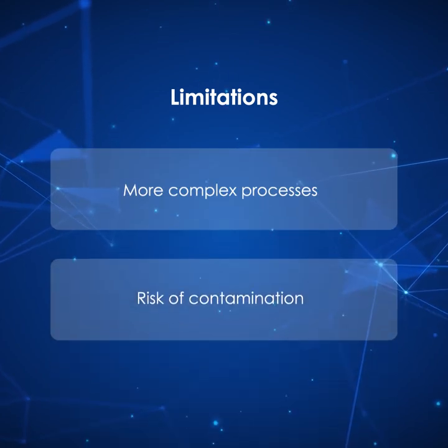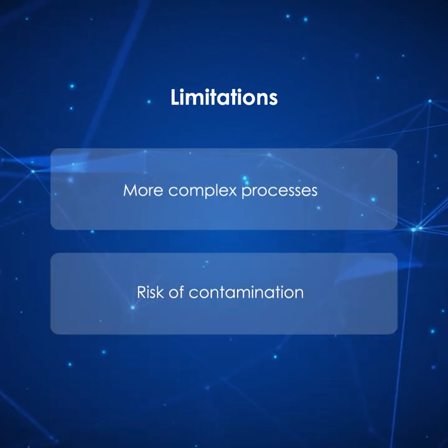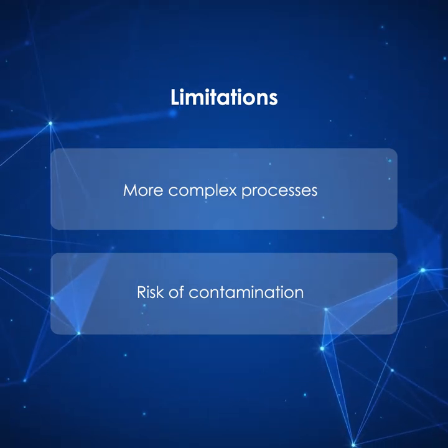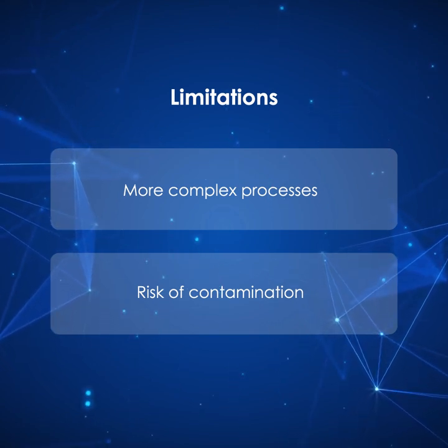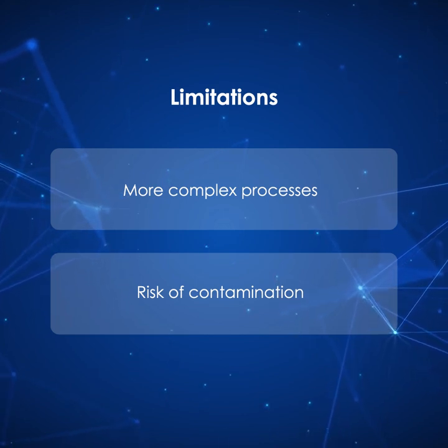Despite having amazing advantages over the conventional PCR setup, it comes with several crucial limitations. It requires an additional primer set and separate reaction setup, which is tedious, time-consuming, and costly. Also, as we need to prepare 2 different reactions, it has a higher risk of contamination.